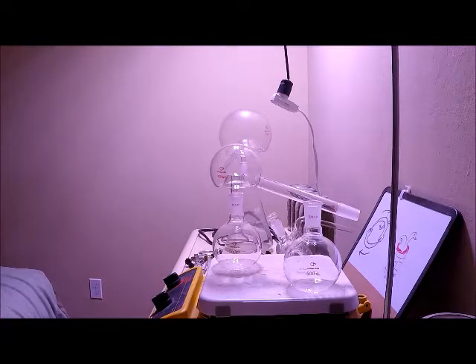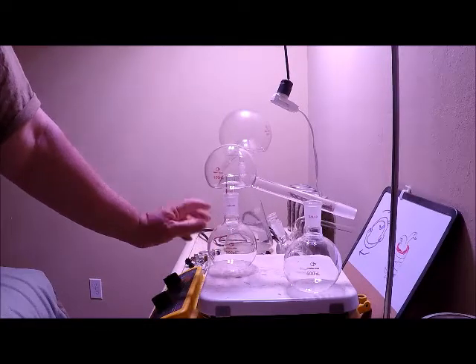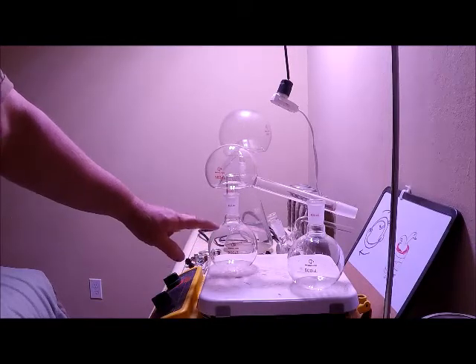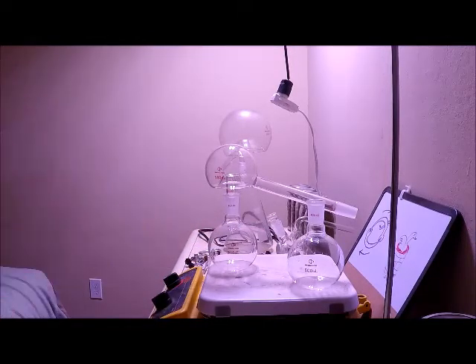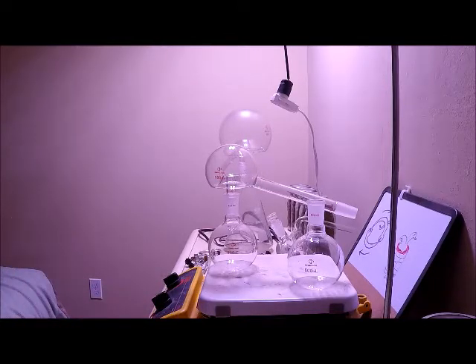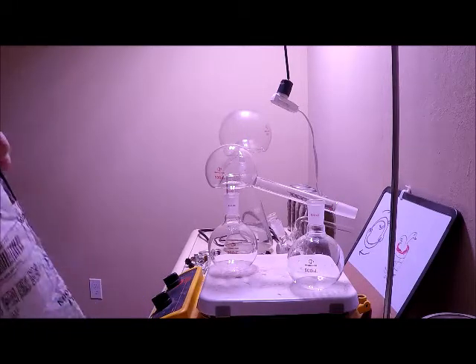And as I proceed with experiments, of course, I'm going to add more pieces of equipment. So I'll probably end up with a few different sizes of these. I got the 500 ml this time. I was going to get the 1000 ml to put here under the distillation head, but the current price when I was looking was really high. The prices fluctuate. And the price was so high in comparison to the 500 ml, the difference in price was so great that I decided at this time I'll go ahead and get the 500 ml sizes and then I'll get a larger one later when the price comes back down towards planet earth.